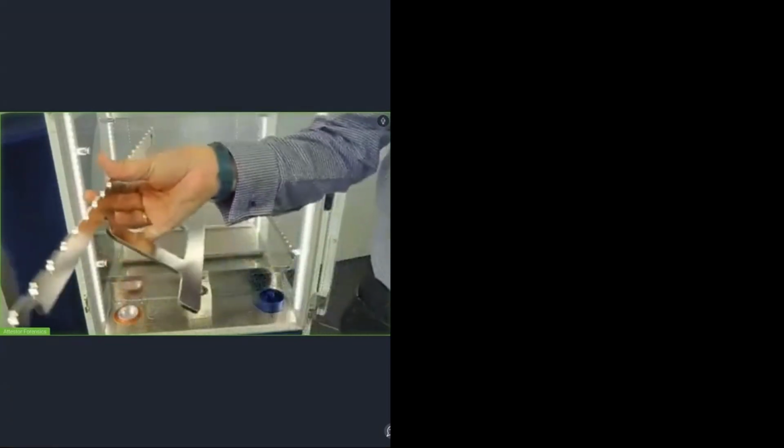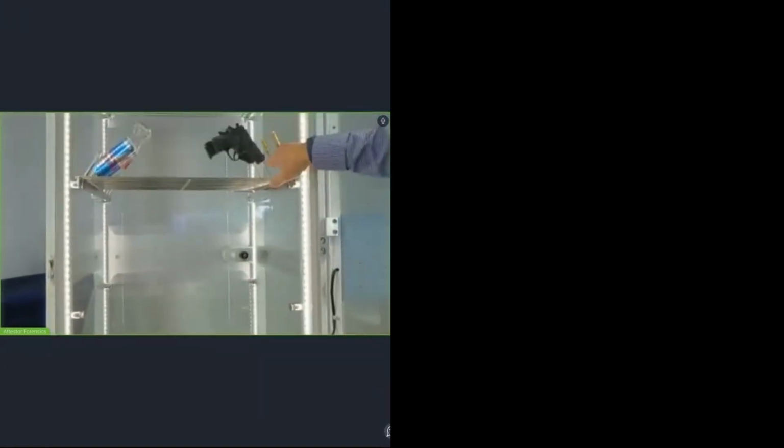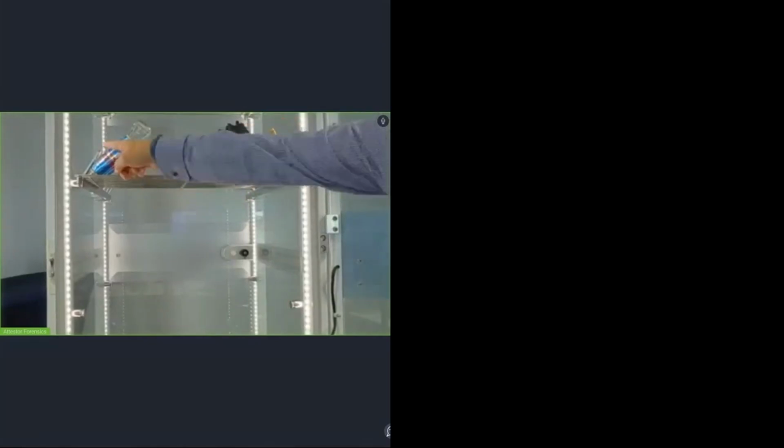Yeah, okay. That's one of the special racks, which sits in the bottom to put on long shaft rifles, for instance. And in the upper part here, you have the cross, the counterpart for it. And also that one is the pin support system, with very strong ones here for heavy stuff and a bit more light ones for that one. What I wanted to show you is the stuff on the bottom here.